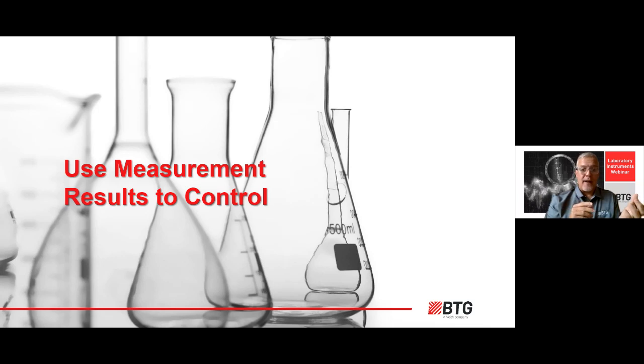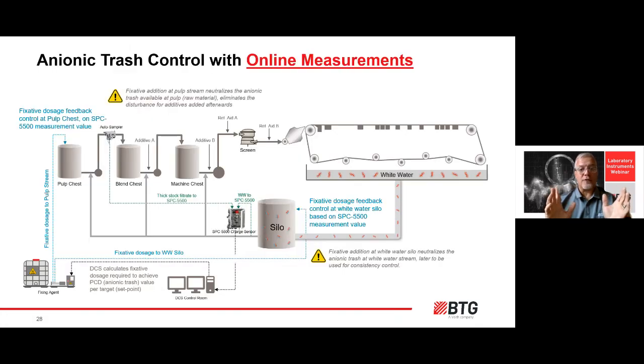As Manfred outlined, you see information from this mapping on the water charge and the fiber charge. It is critical to continue to look at the fiber charge, and mostly that's done on the benchtop. On a day-to-day basis, once you've identified how you want to approach it and what you're managing, the most common way to control it is to look at the water charge.